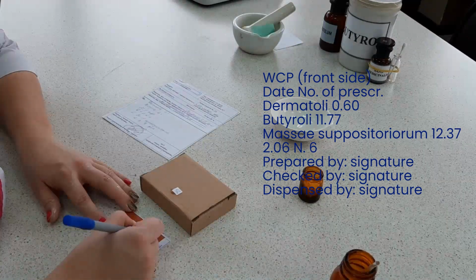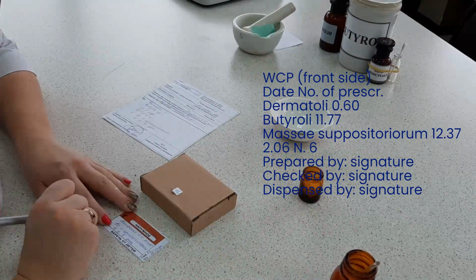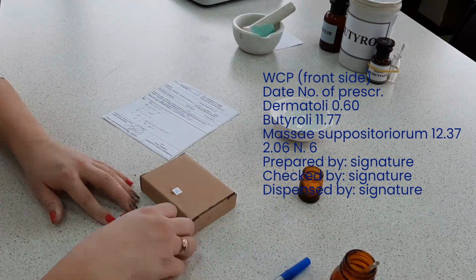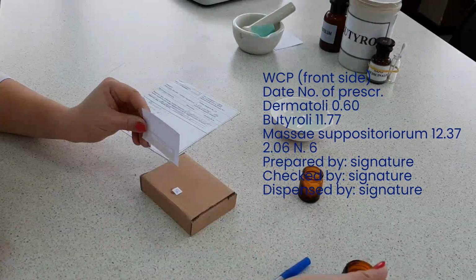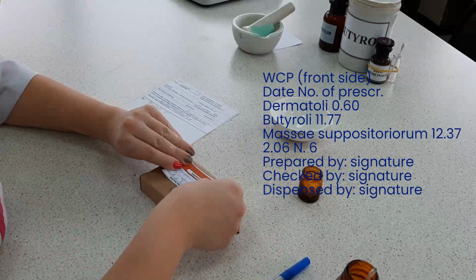Apply the label "External". The patient's last name, first name, and age are indicated on the label, as well as the method of using the suppositories. Attach an additional inscription: store in a cool place, keep out of reach of children.